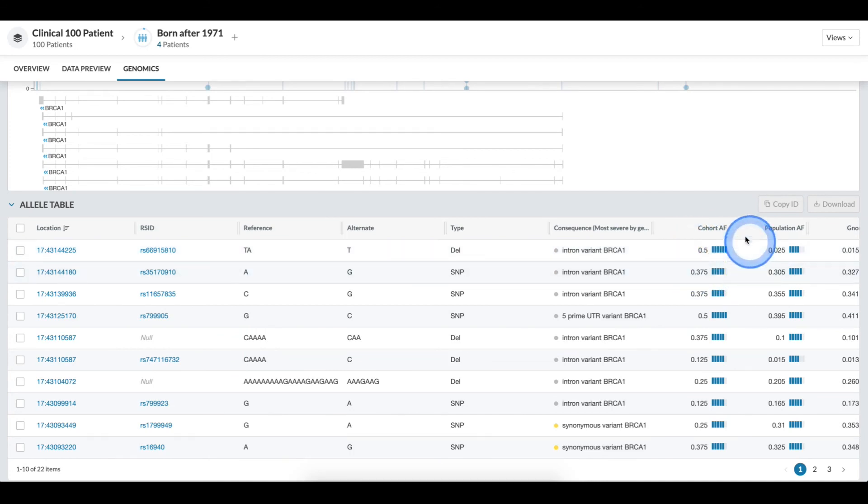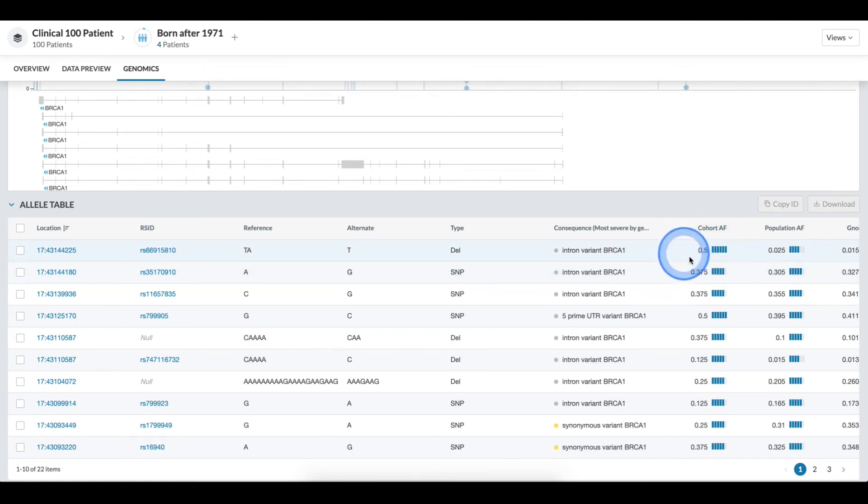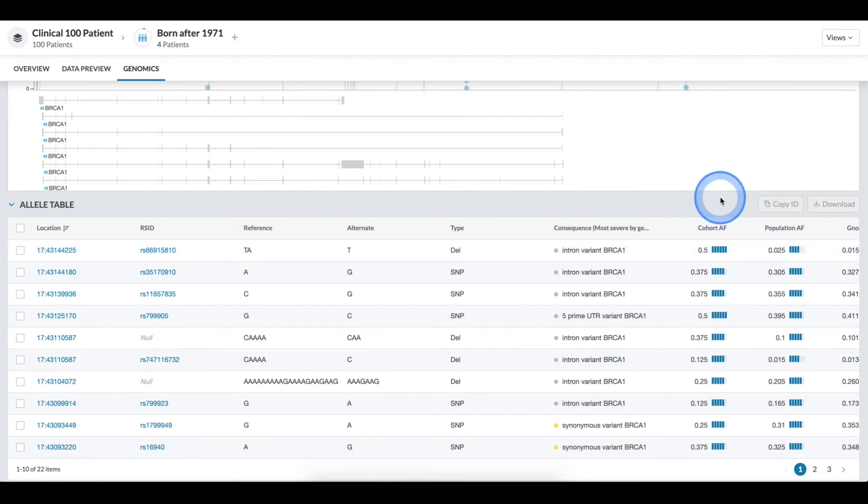Interestingly, I can see that my cohort allele frequency for this particular RSID is 0.5, leading me to conclude that all individuals in this population are heterozygous for this allele.